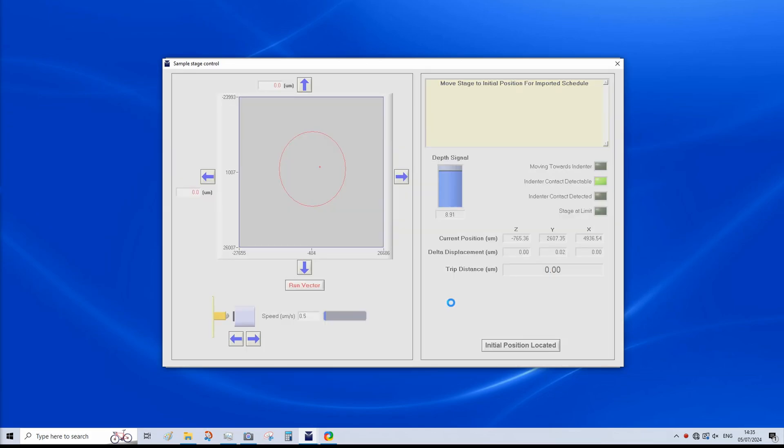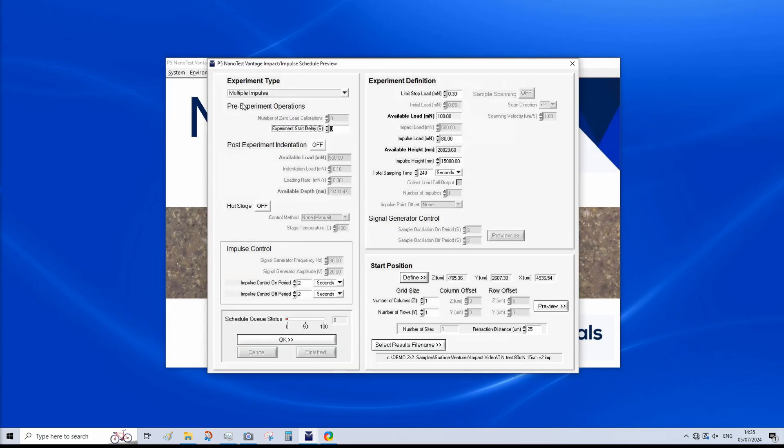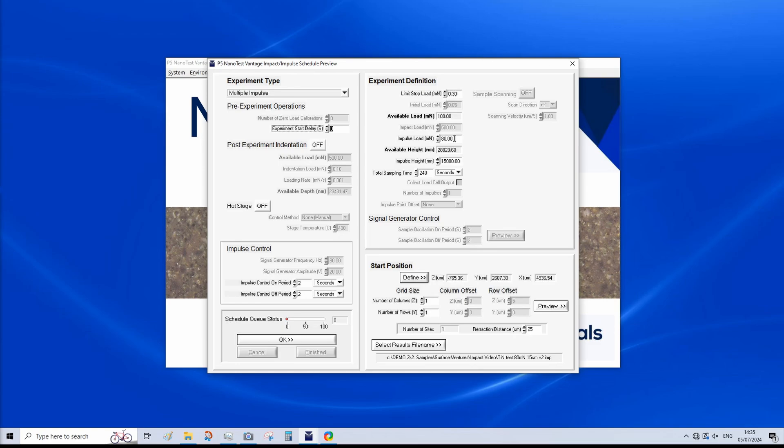So we've selected the multiple impulse option, or impact in this case. Now we can input, or have inputted, the key parameters, such as impact load. In this case, we have 80 millinewtons. And this is the normal force applied through the load head. The impulse height, also referred to as the acceleration distance. The impulse height here is 15,000 nanometers, or 15 microns. And the impact frequency. So we can see this just here under impulse, pulse control. There's two seconds on and two seconds off, which gives us one impact every four seconds.